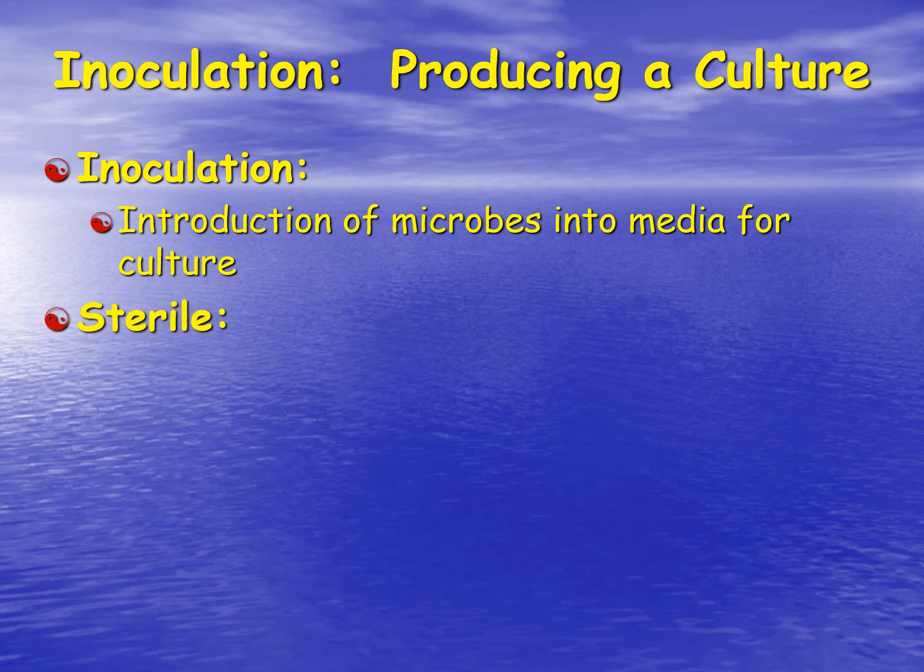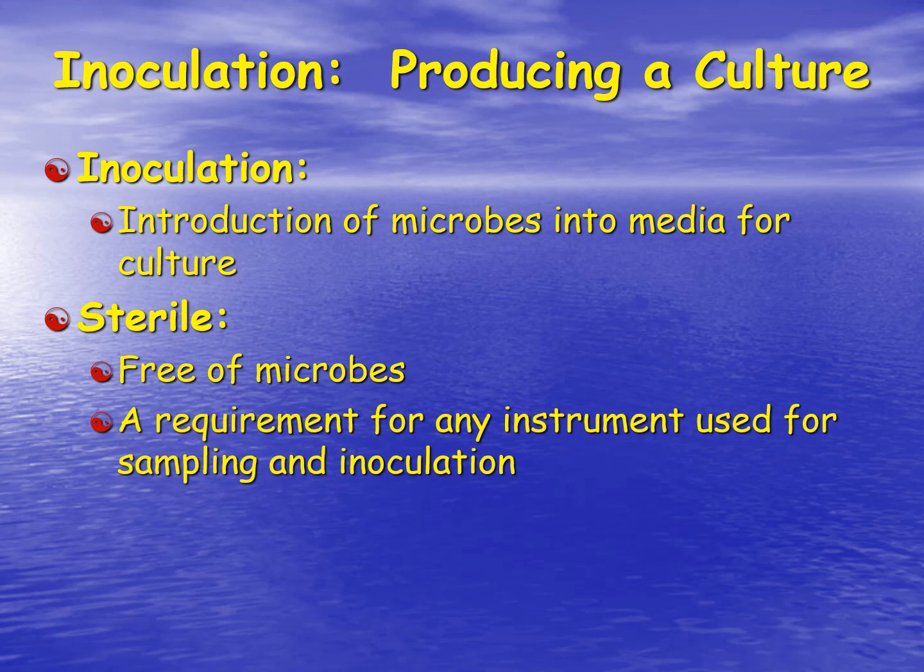We first want our medias to be sterile. That means we want them to be free of all microbes, and the microbes we introduce through inoculation will hopefully be the only ones that will be growing. So sterilization is a requirement for any instrument used for sampling and inoculation.